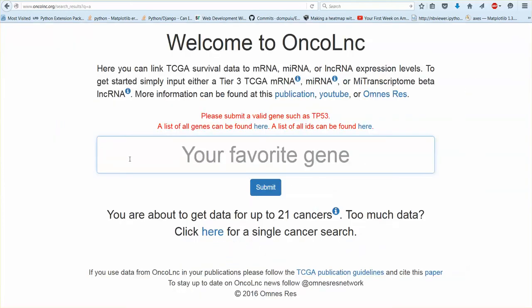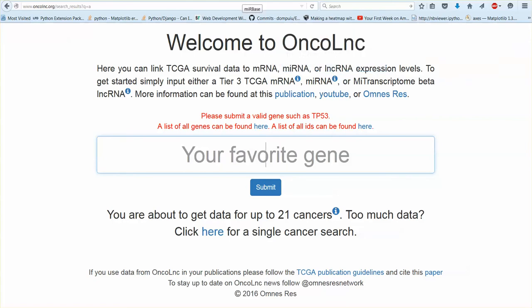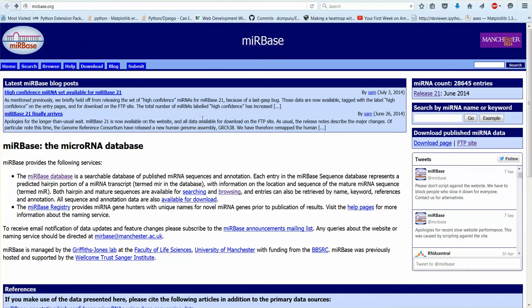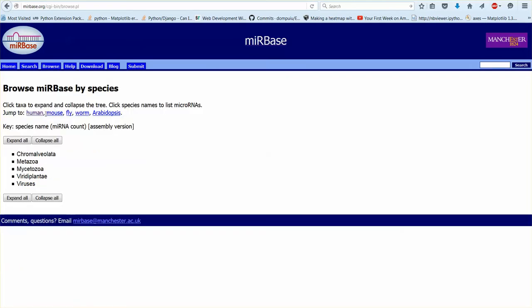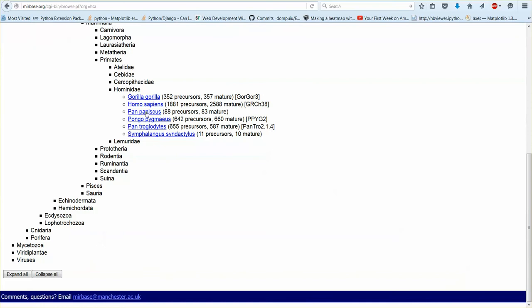Okay so what about microRNAs? MicroRNAs are a little bit interesting. So you need the current mature MIRBase accession number or name. So what does that mean? So if you go to MIRBase, you go to browse, you go to human. I gotta click human.